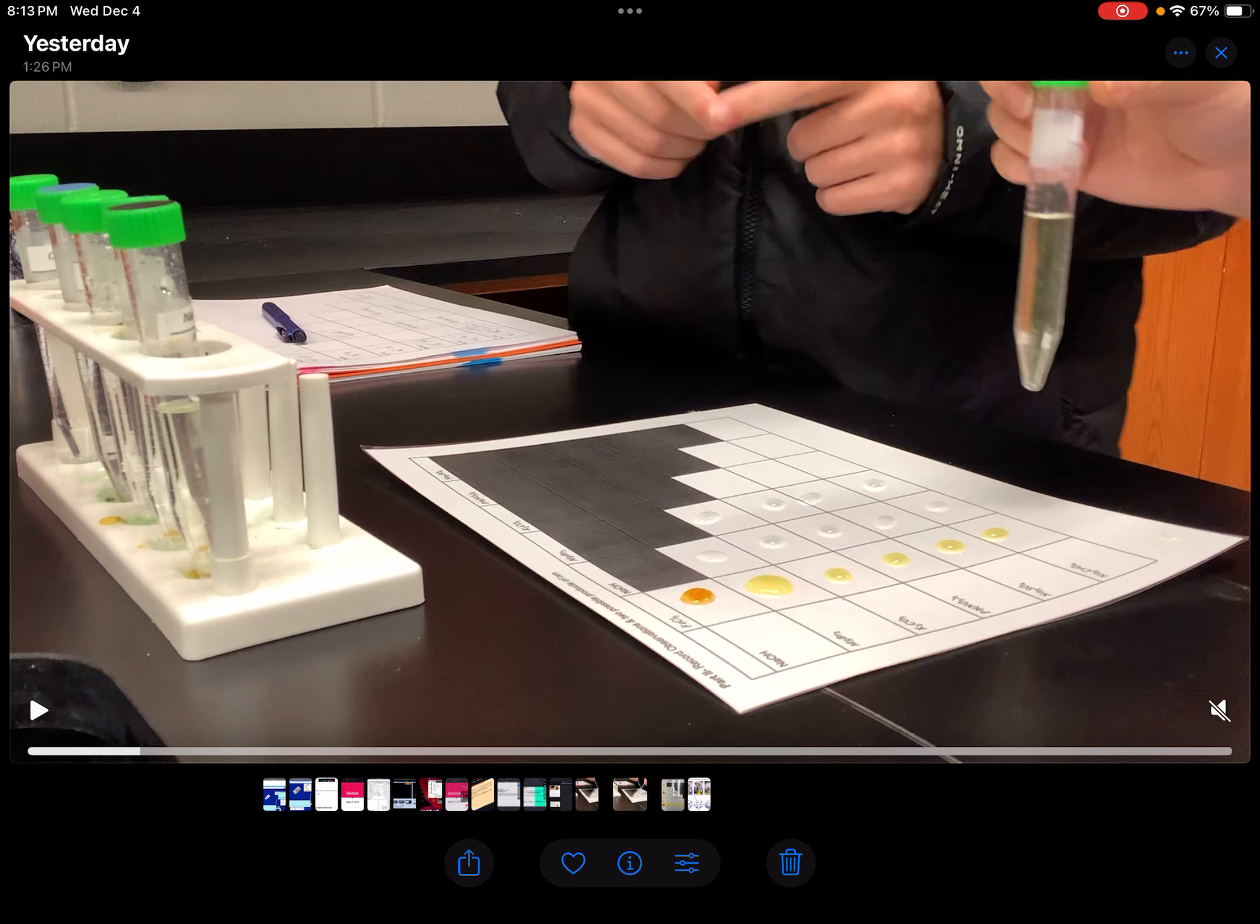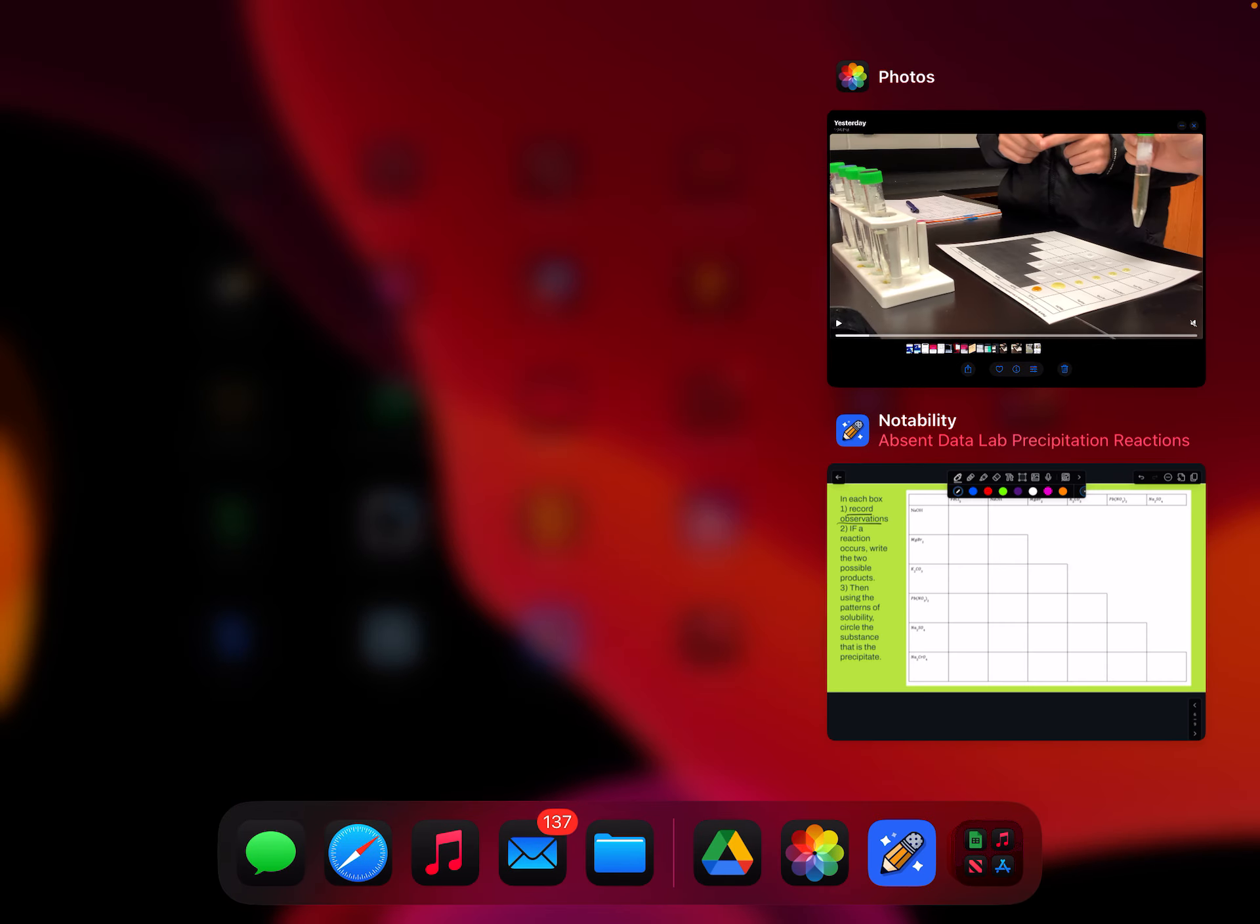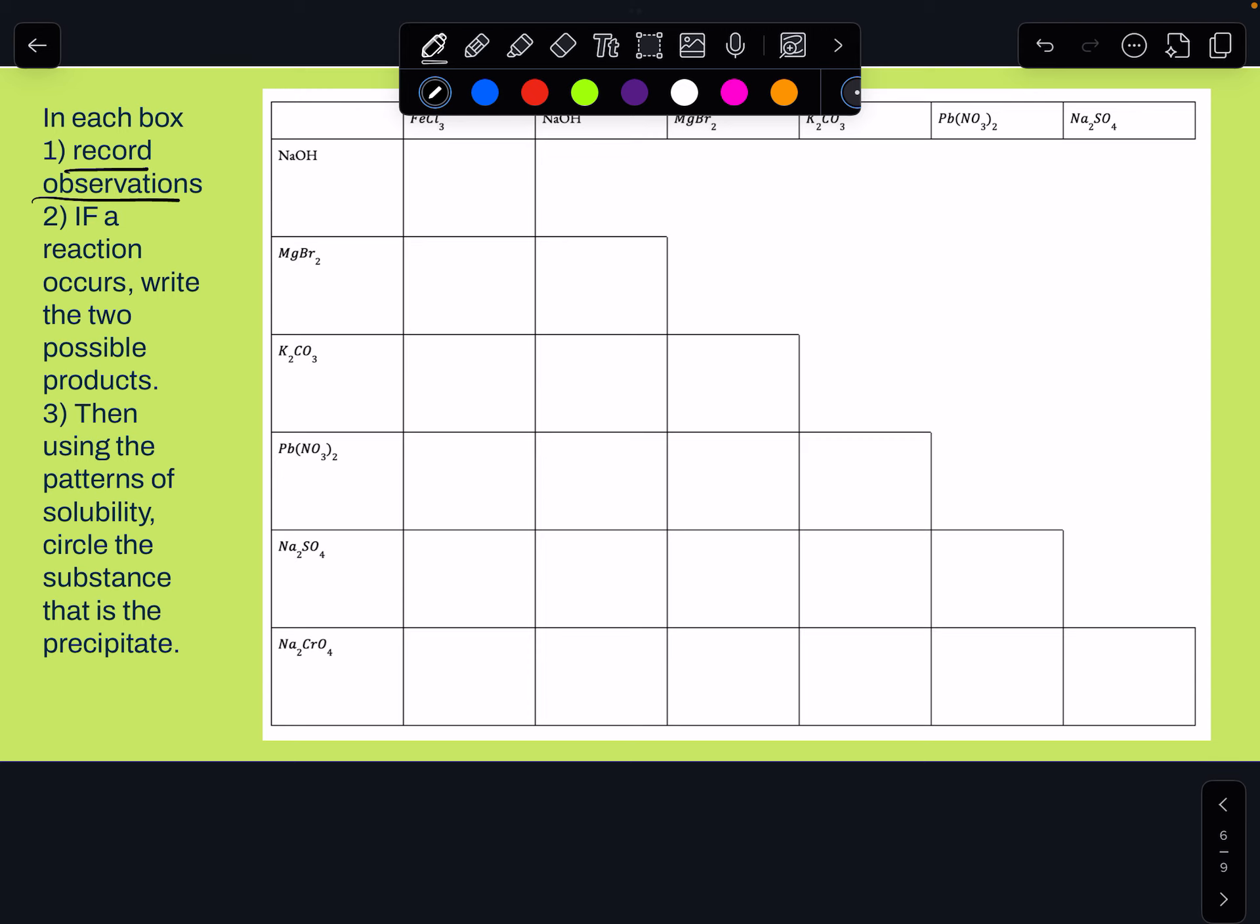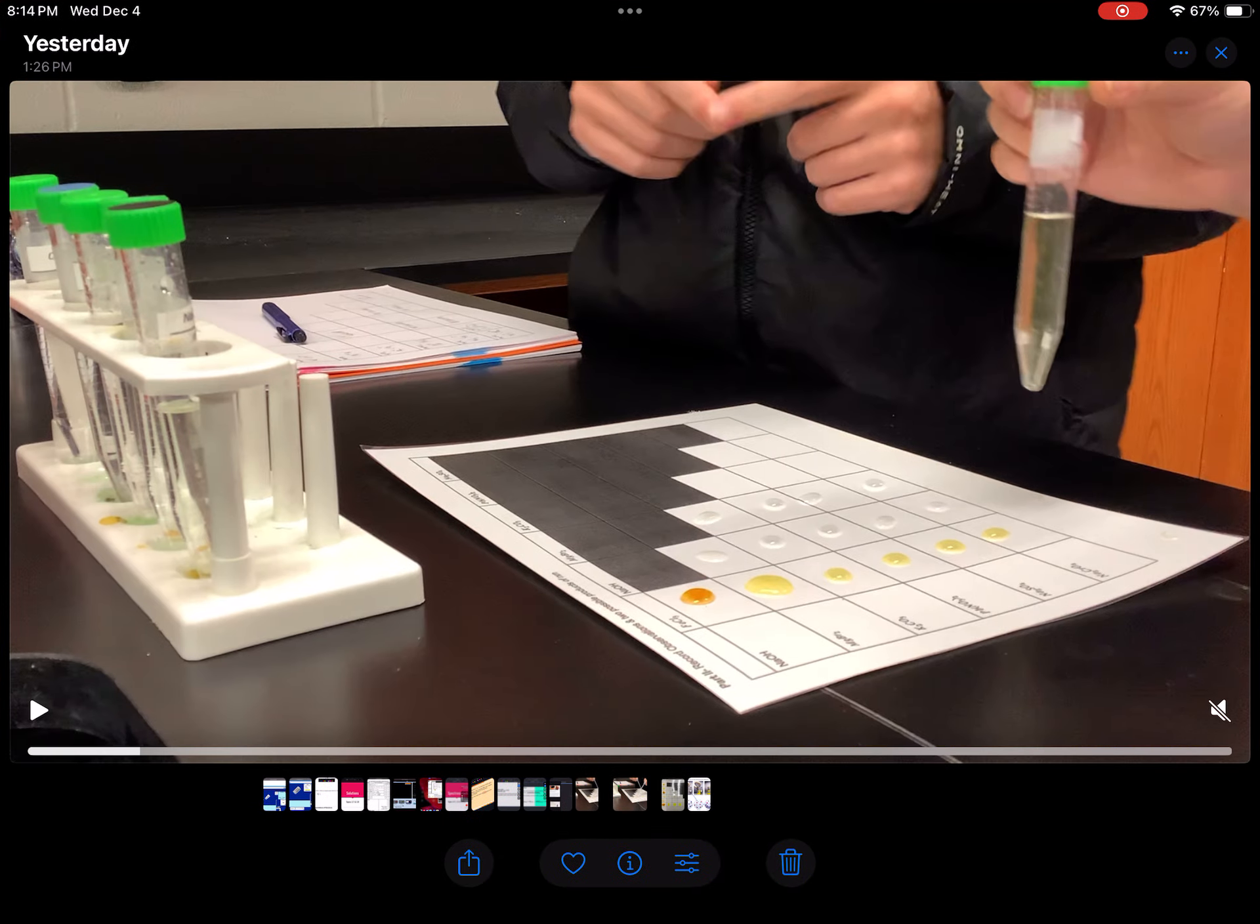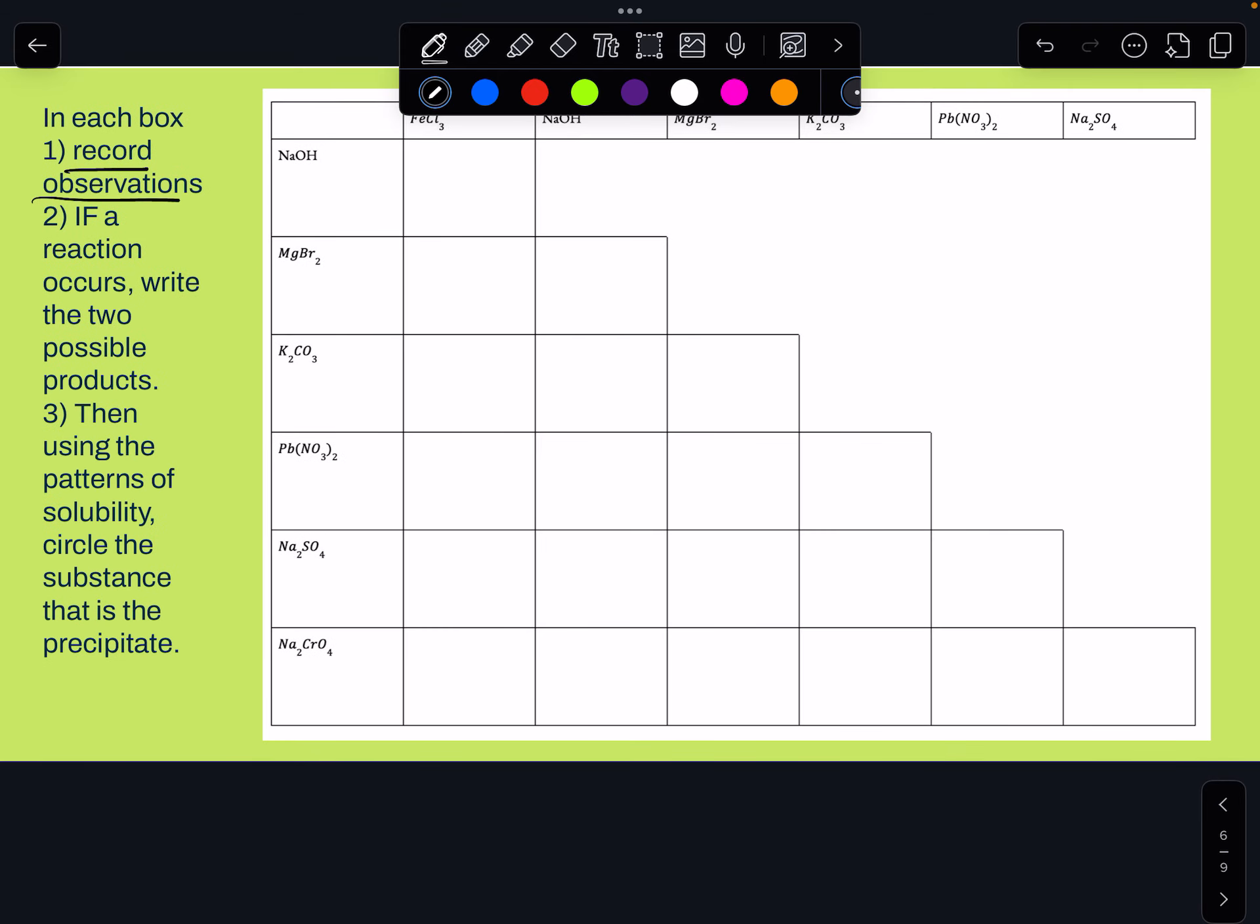Let's pause here for a second. What we're gonna do is go to our data table and record our first box, our observations. In this one I can see there's a little dark brown precipitant going on there. So I would say dark brown is the color change I see going on. Key thing here is that precipitation. And the second one I'm gonna write no reaction, no observations. We mix them together and there's no apparent change in color, no solid was formed. No reaction or no precipitant.